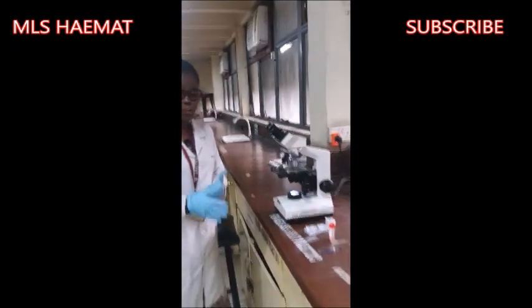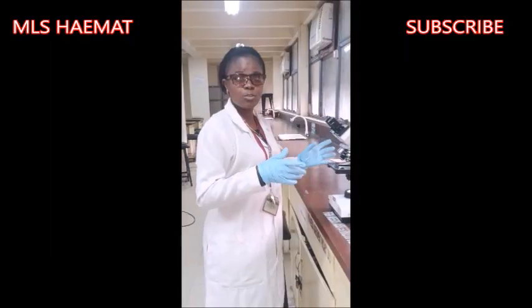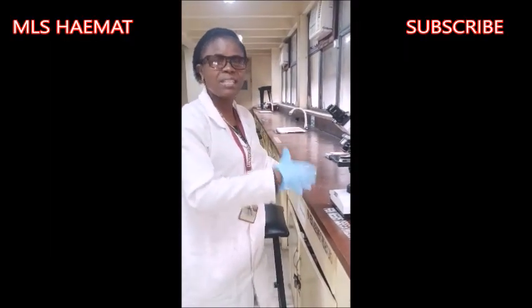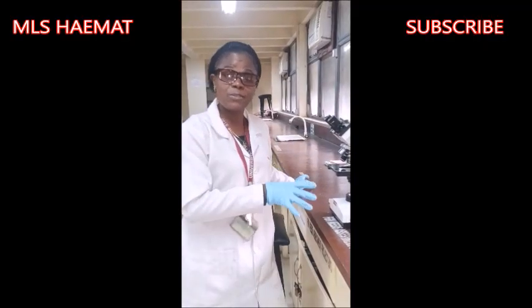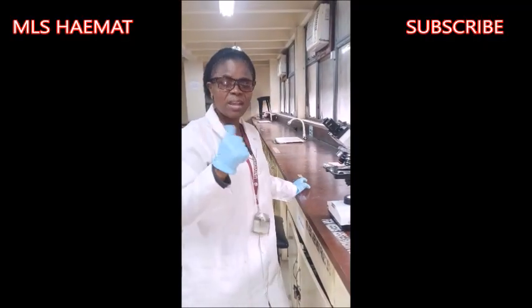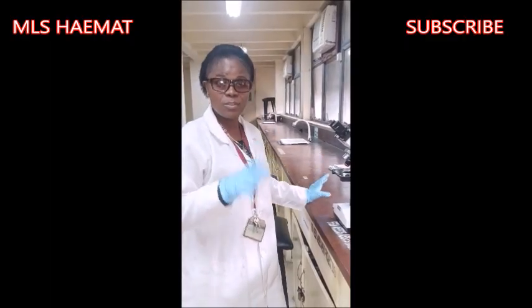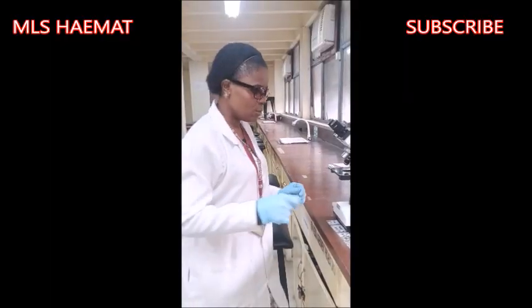So it's important for you to know that for you to be able to focus the microscope, you must know the different parts of the microscope and the function of those parts. If you don't know the different parts of the microscope, you need to go back and watch the video where I talked about them. But in this video, I'll just be talking about how to use the microscope.